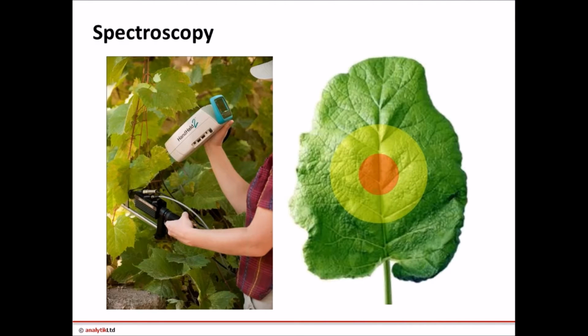The drawback, I guess, for spectroscopy is that you are only collecting information from one average area. That spot could be very small, just a millimeter across, or very large, a couple of centimeters across, but it's always going to be the average of everything in that area.